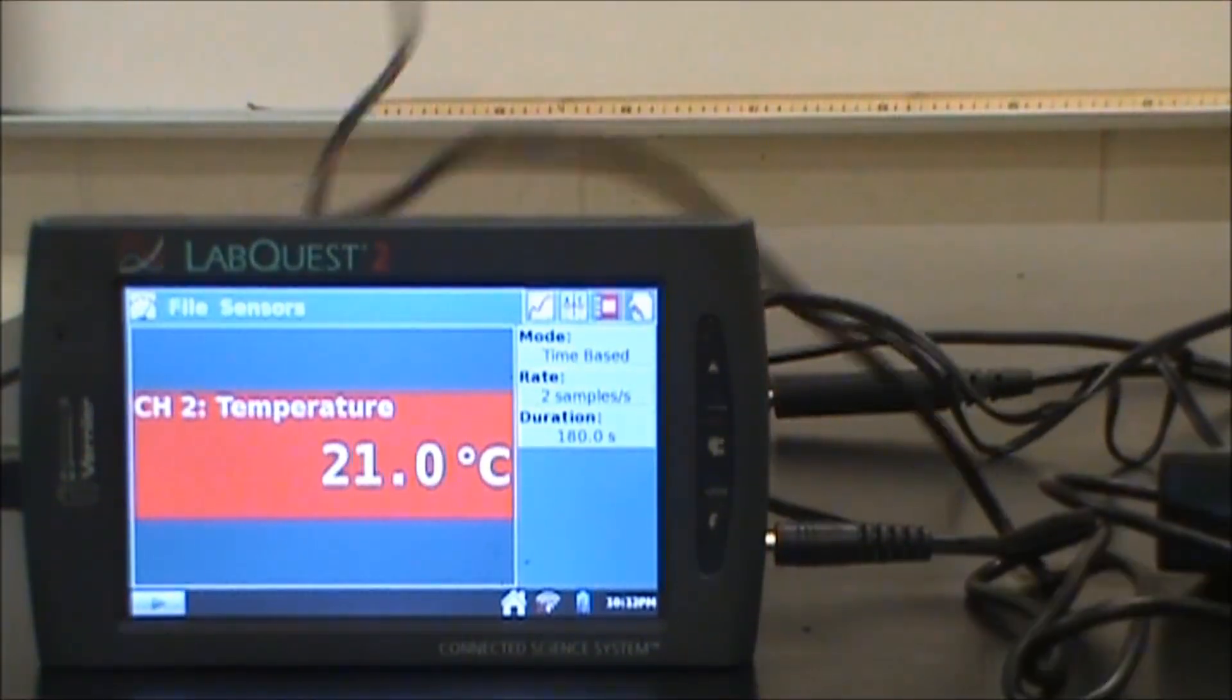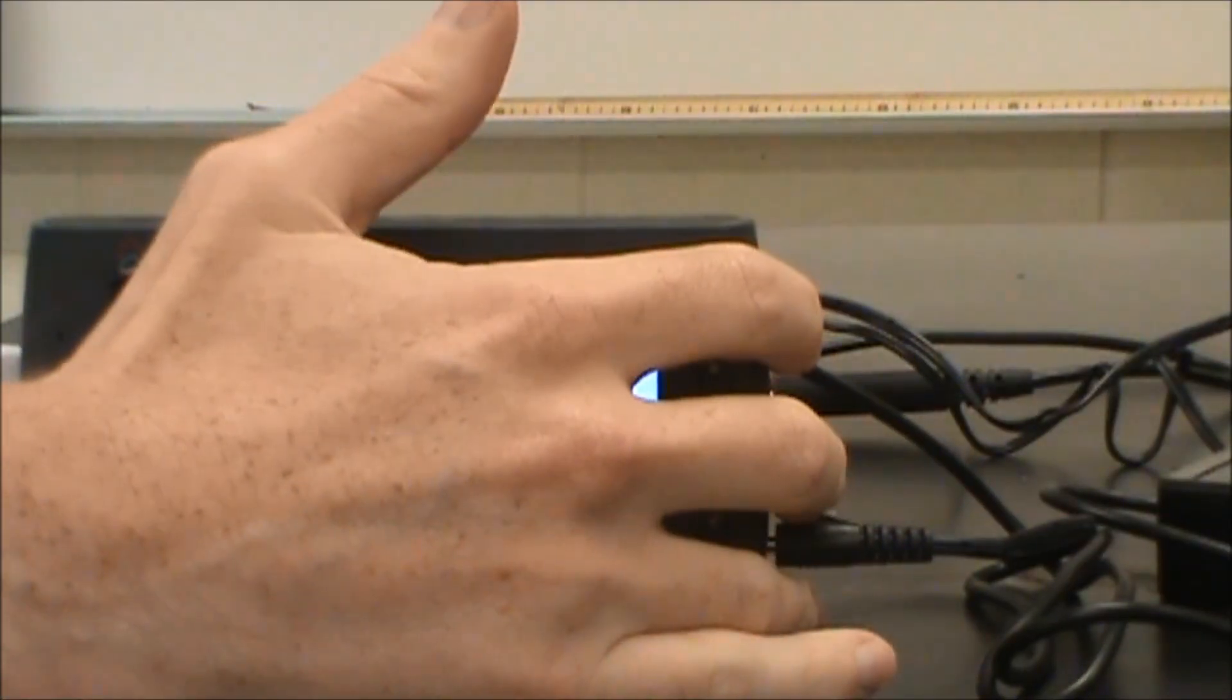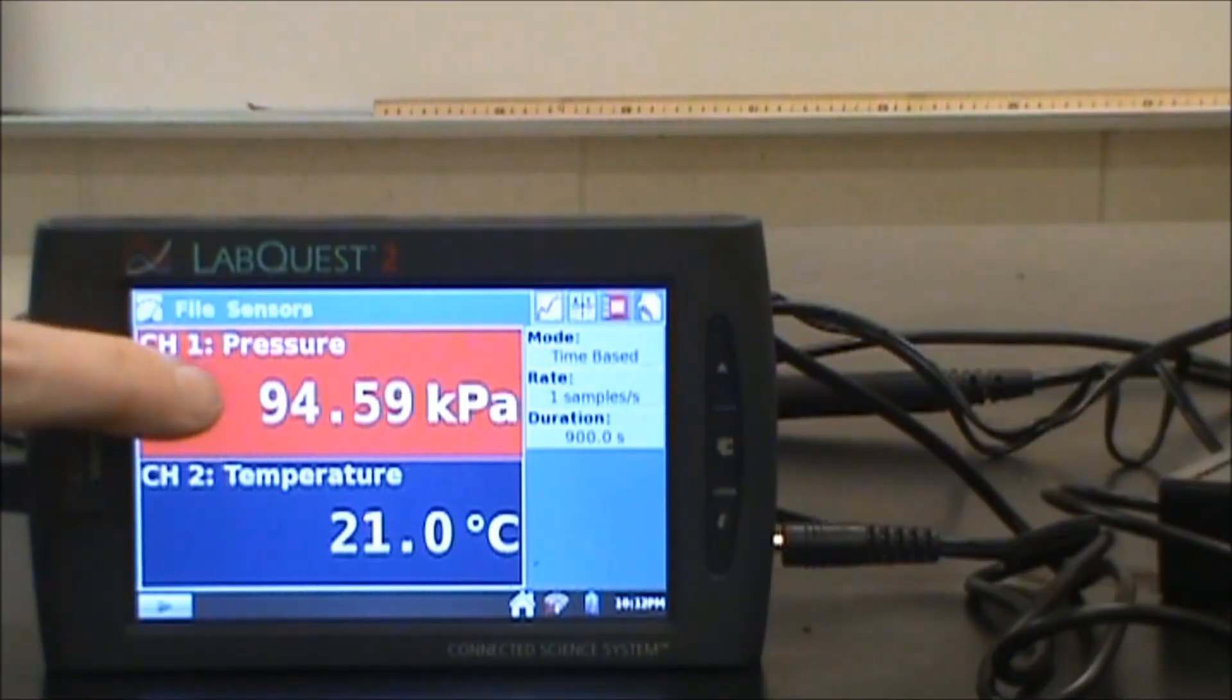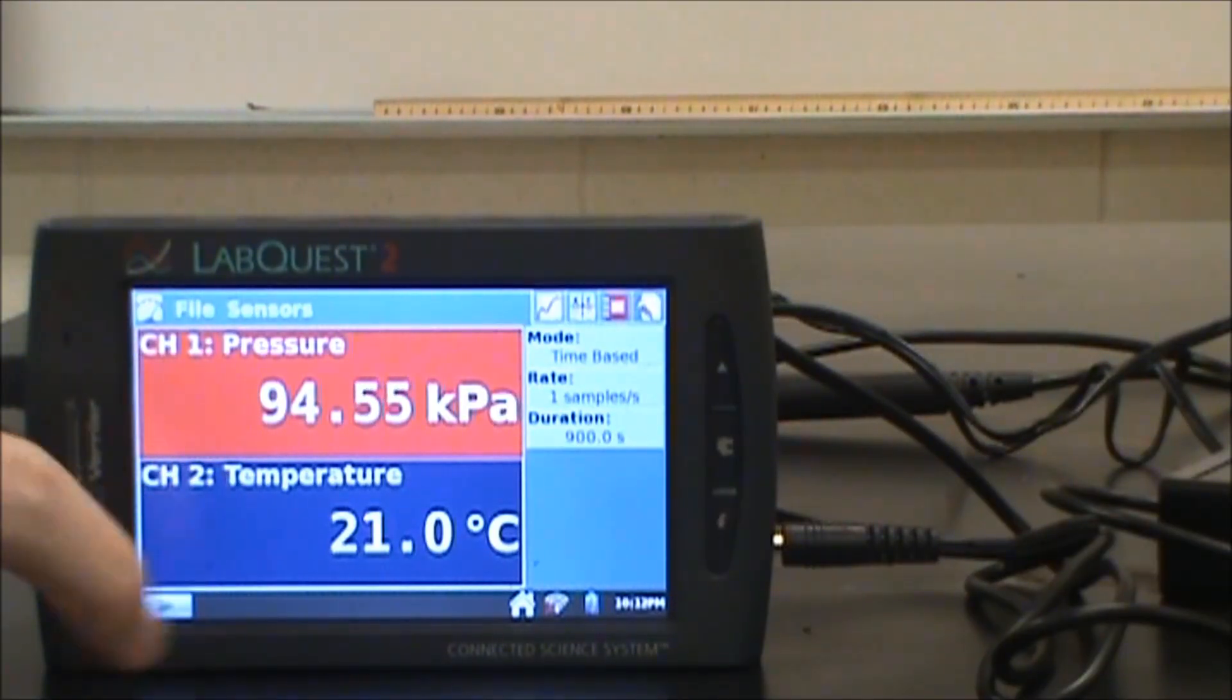Then I'm also going to take the gas pressure sensor, plug that in. It doesn't matter which one you do, and then it's going to give me two. Channel 1 is the pressure, channel 2 is the temperature.